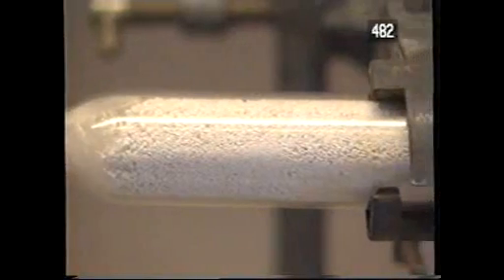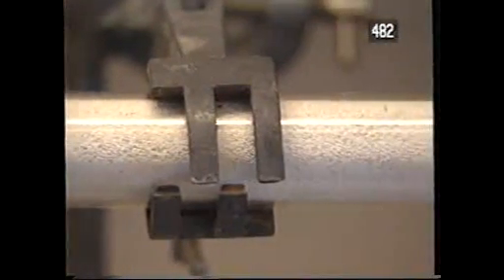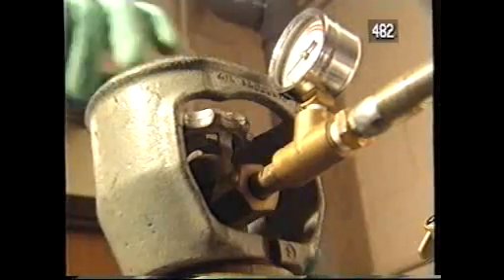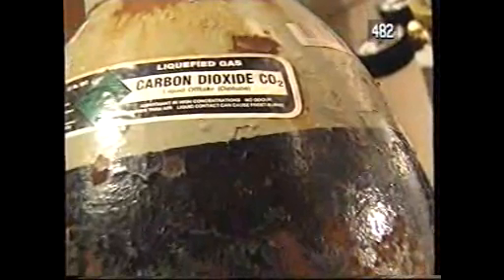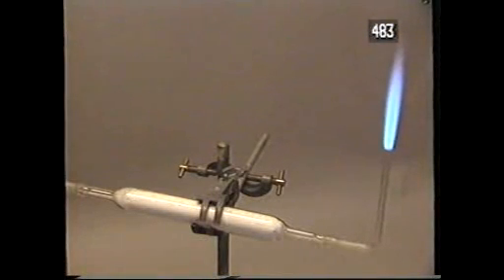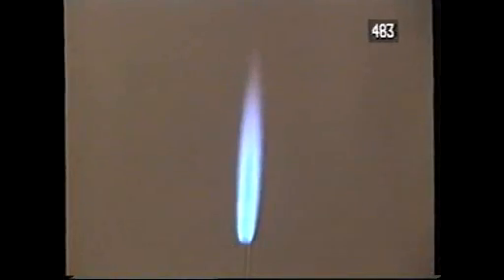The soda-lime tube removes the surplus carbon dioxide. The carbon dioxide going in is used to put fires out. The gas coming out burns with this beautiful blue flame. So what do you think it is? It's carbon monoxide. Carbon monoxide is also a deadly poison.